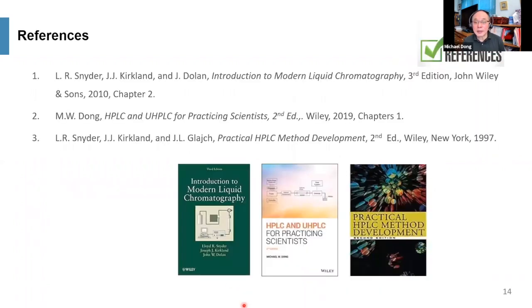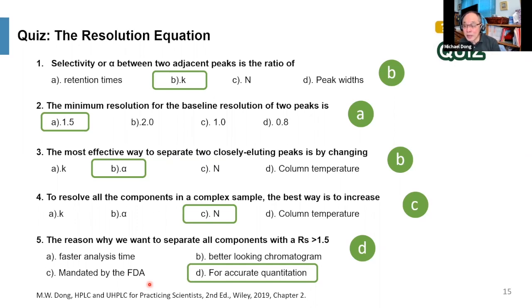Okay. So here are the three references. Right? FDA is probably okay with it, right? Obviously, you have to try, right? You can't say that you can't get it. You have to document what you did, right?